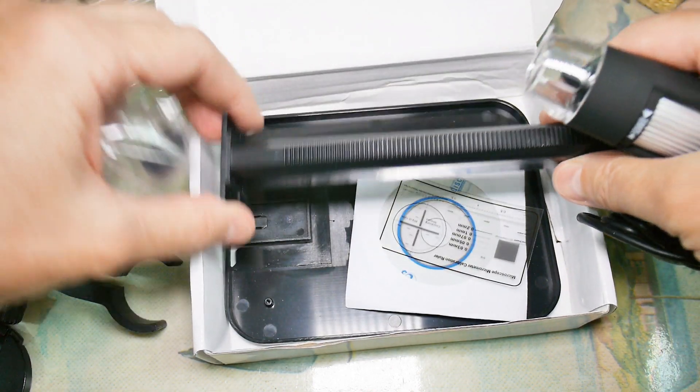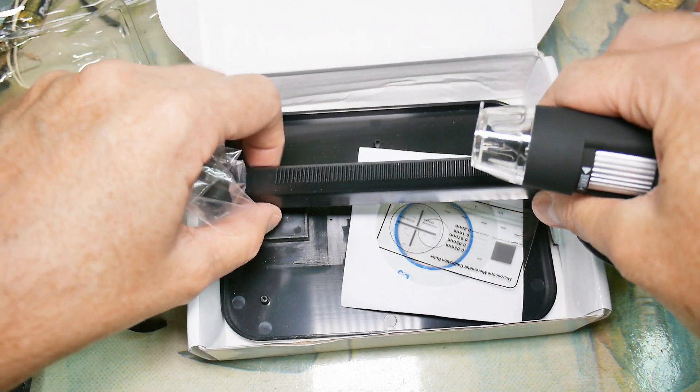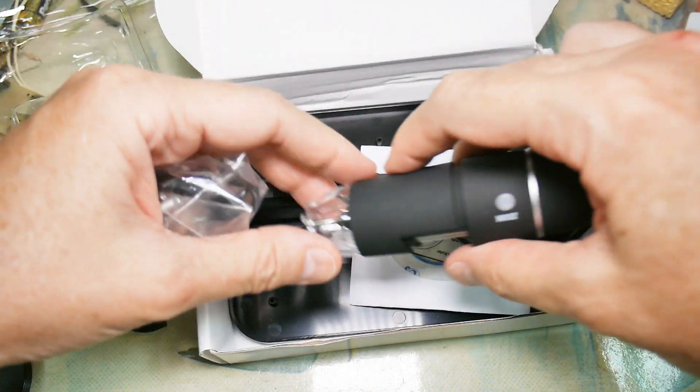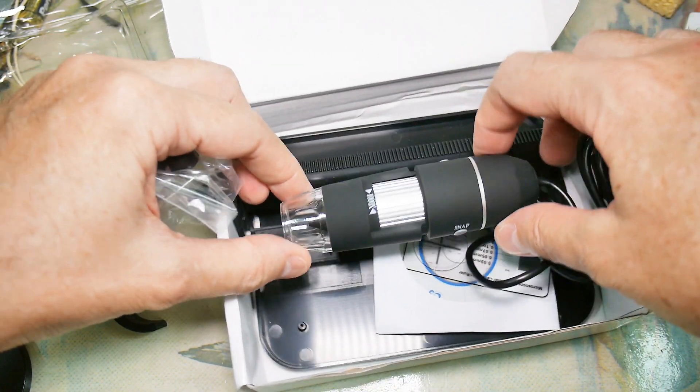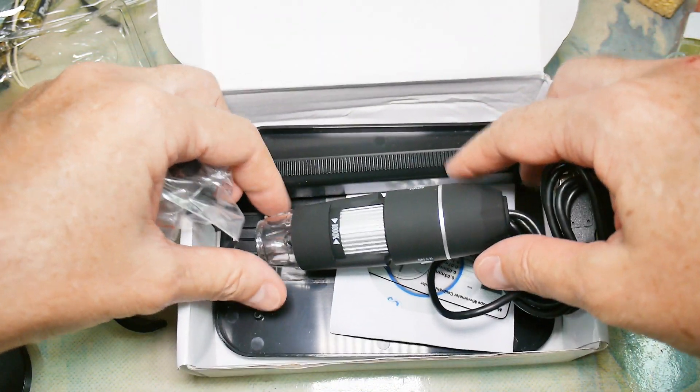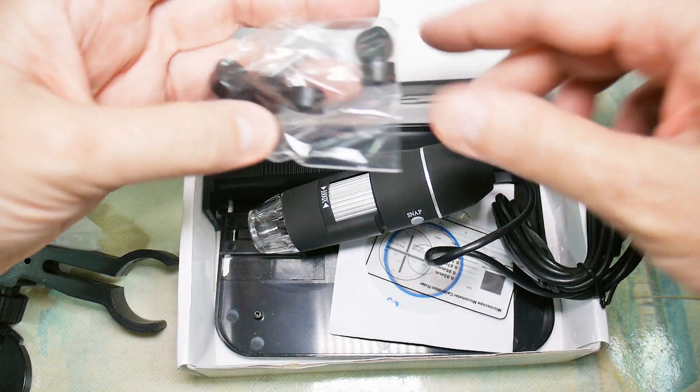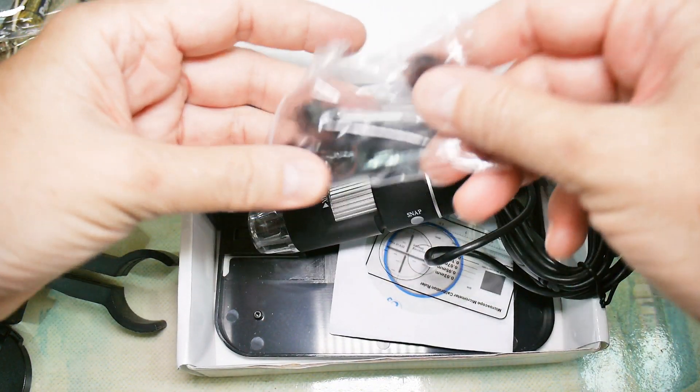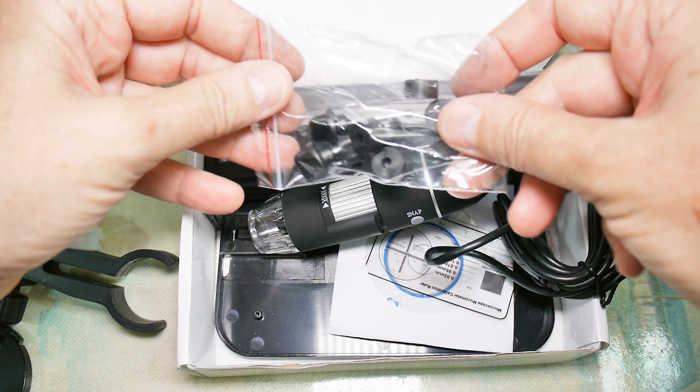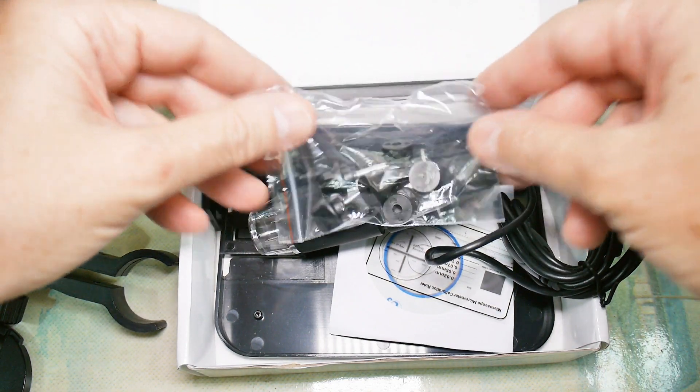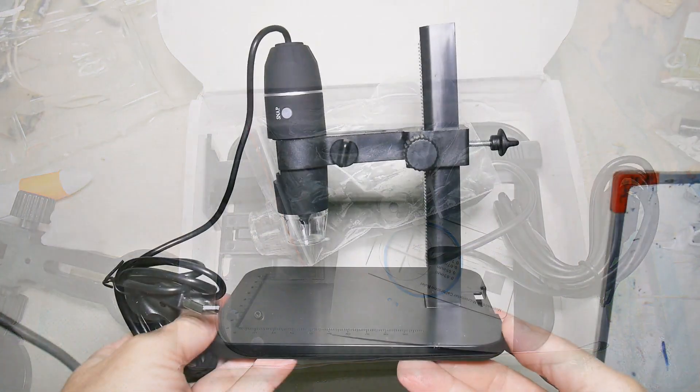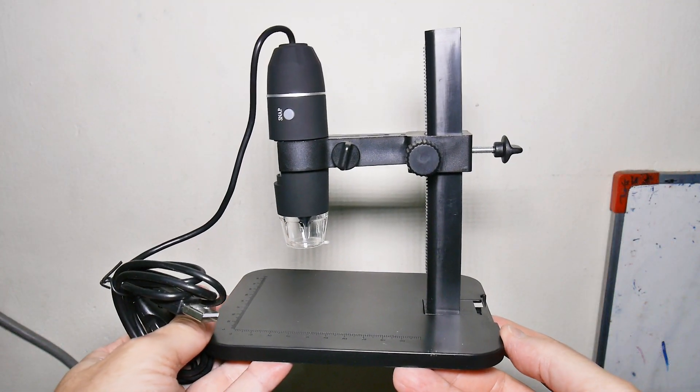It's got a little plastic stand with a ratchet on it. I'll go put it together and we'll give it a try and see if it's worth the ten or twelve dollars I paid for it. Well, this is it put together - took about all of five minutes.